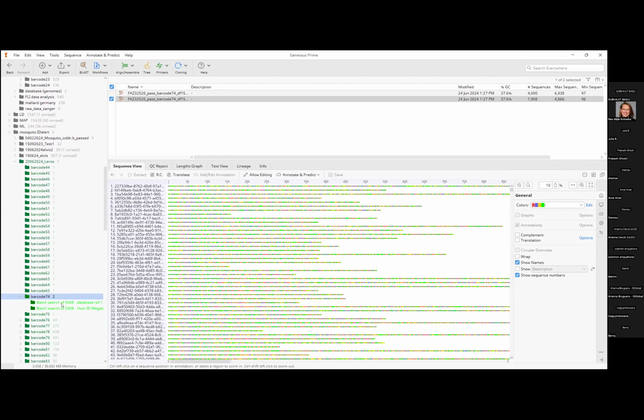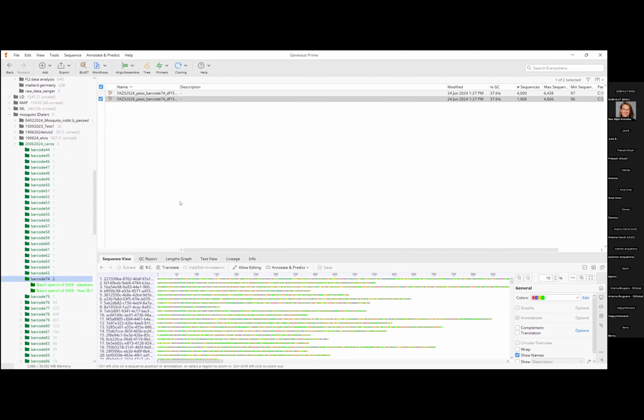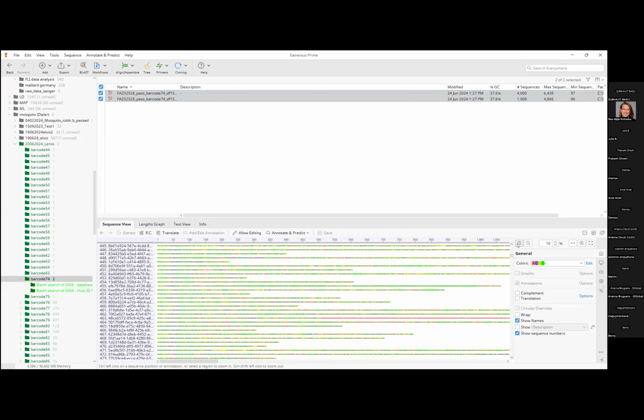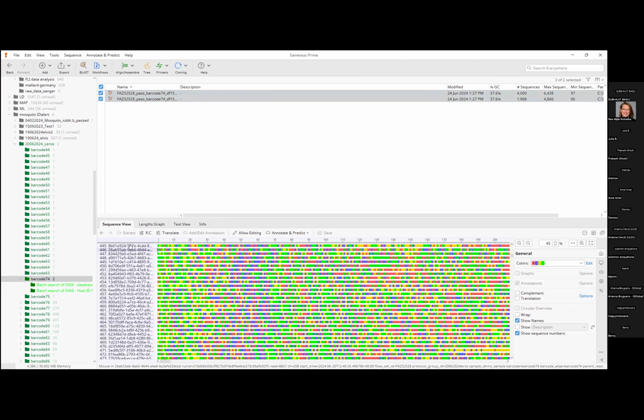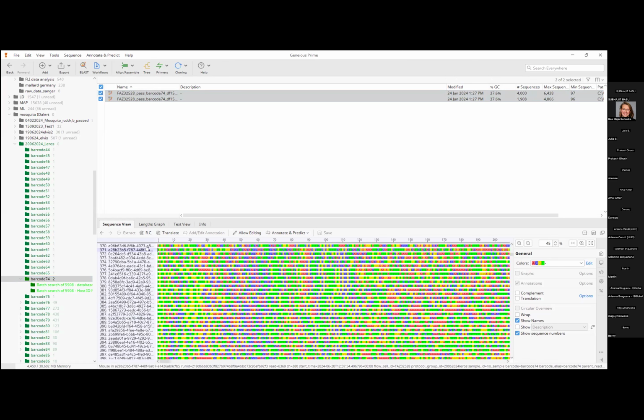Okay. In this case, for example, we tested mosquito samples. So whole body mosquitoes from a certain Greek island. We wanted to see, okay, what species is it? Can I say, based on the DNA that I find in the sample, which species of mosquito it is, right? So in this case, you click on your reads. Yeah, this is the reads that came out of your sequencing device for this specific sample.